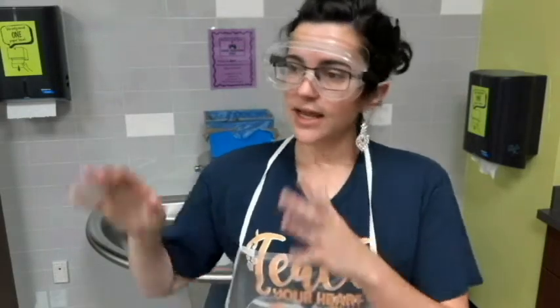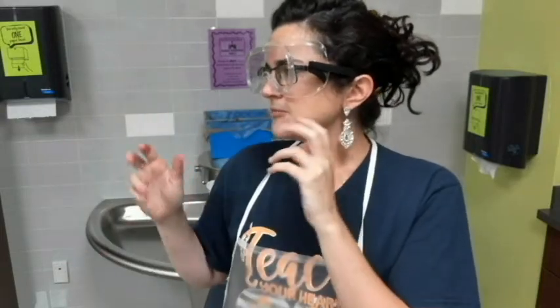So let's say your class comes in and you're working at your tables, you do your labs, you observe and do your investigations, and then all of a sudden it's time to start cleaning up. Well, the first thing you want to do, if it hasn't already been mentioned, is raise your hand and ask your teacher or myself, Miss Bell, where can we put our items when we clean up? Where can we throw them away? Can we dump our liquids down the sink? And you should be given an answer.